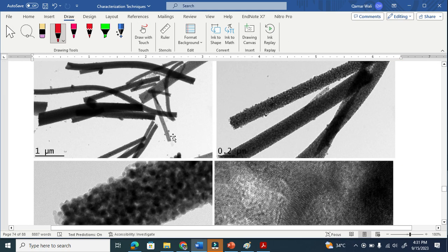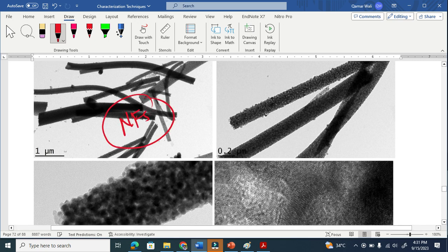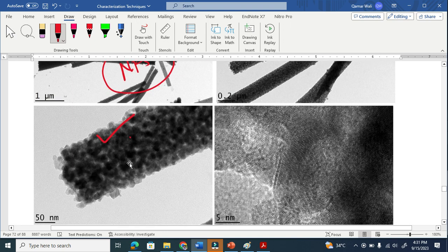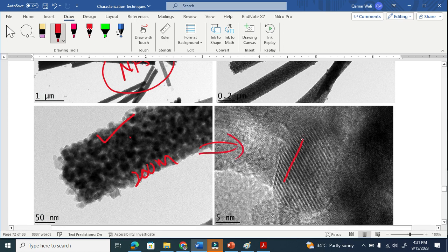Let me explain with another example. Here we have nano fibers — this is a TEM image of nano fibers. This is low magnification, then higher magnification, then even higher magnification. You can see the fiber shape as we zoom in. When we further zoom, we get this shape, and you can see a very clear large grain here. We can see two lines separate here, which means the resolution is good here.